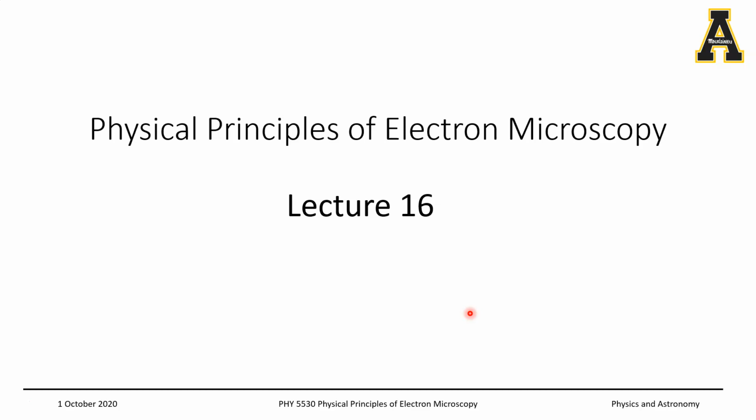And in fact, what we're going to discuss today is true for any ultra high vacuum system, be it an X-ray photoelectron spectroscopy tool or a deposition tool that you might use in your research, or you may come across, for example, a sputtering system or a pulse laser deposition system or any other vacuum system that requires pressures that are in the 10 to the negative 7 or 8 torrs, which is generally considered ultra high vacuum, right?